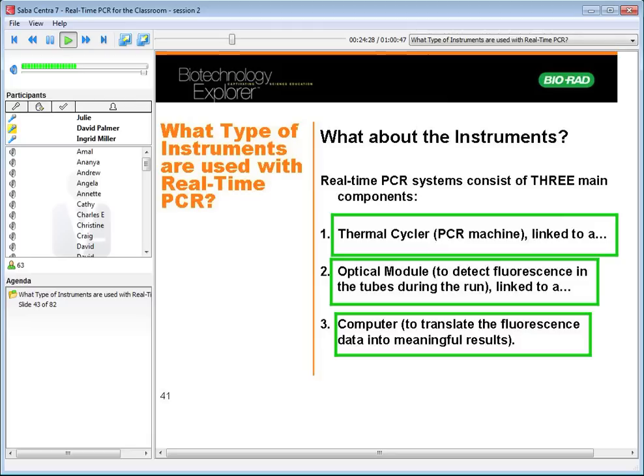So sometimes if things like this go wrong, for example, our replicates aren't tightly clustered, it might be pipetting error, our PCR reactions may not be optimized, samples might be evaporating because they weren't sealed properly. Maybe we've got too much or too little of our unknowns and it's just too little to detect. Or maybe the instrument isn't calibrated properly. Some instruments need calibration.